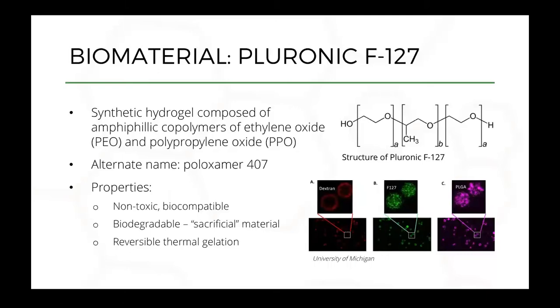But as you increase the temperature, it is in a solid or semi-gel-like state, so it becomes very printable. Today we will be using this material to print the different scaffolds that we'll be creating with you. And this is also a material that is non-toxic and biocompatible, so it's already been used in the materials community for various tissue engineering applications.